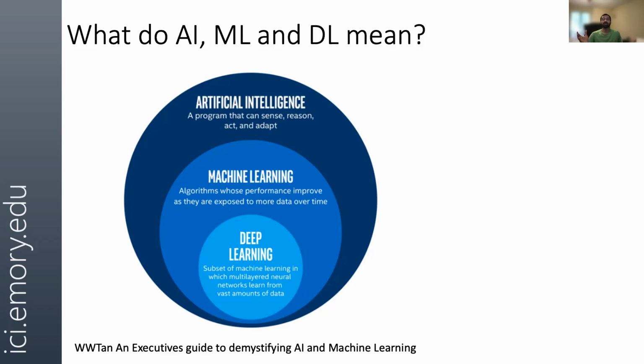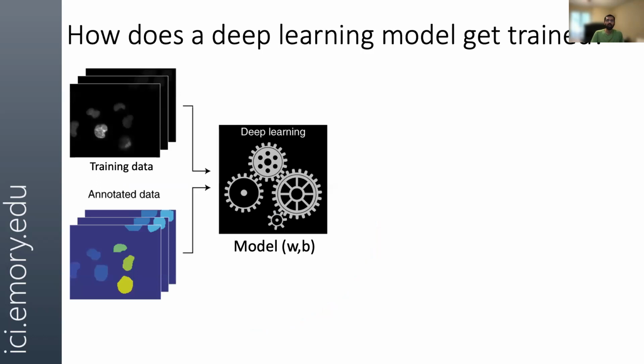So everything we are doing today is very generalist, based on the cells and the nuclei that people have trained and the models that were generated based on existing data. If you have a very unique data set that does not work really well with the models that people have trained, and that you will be using with either StarDist or Cellpose, at that point, training your own model really helps you. So what does all of this mean, right? So how do you train a model?